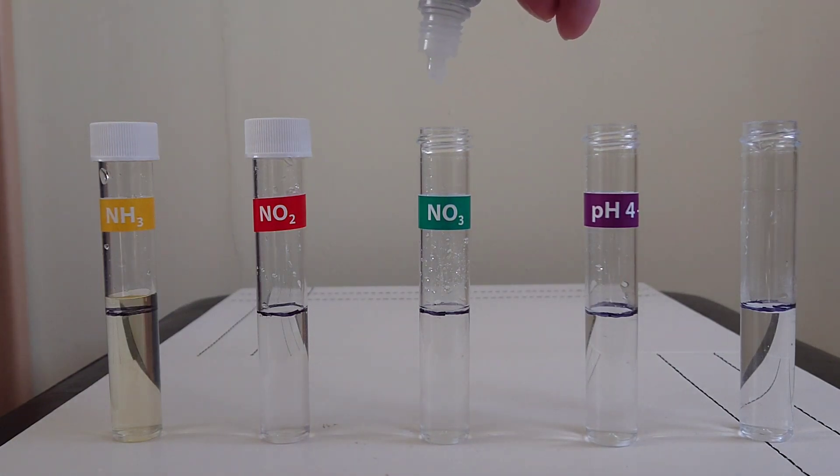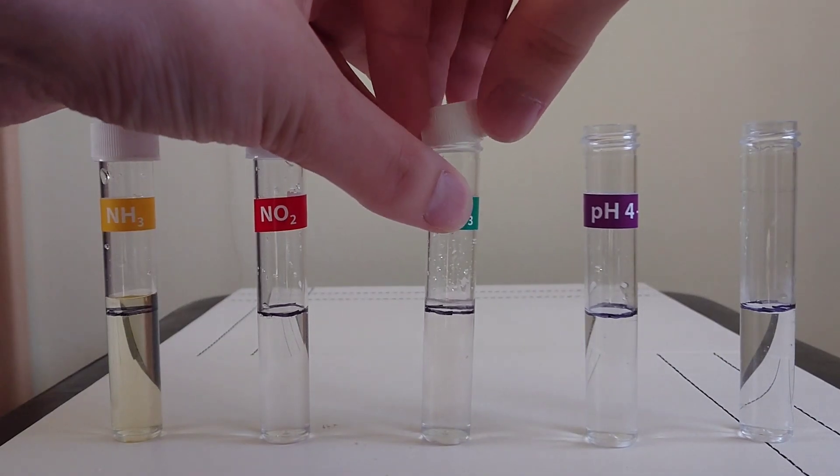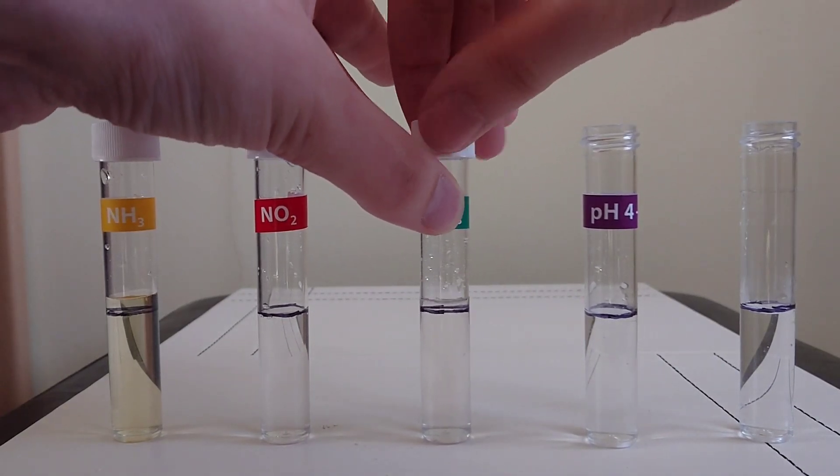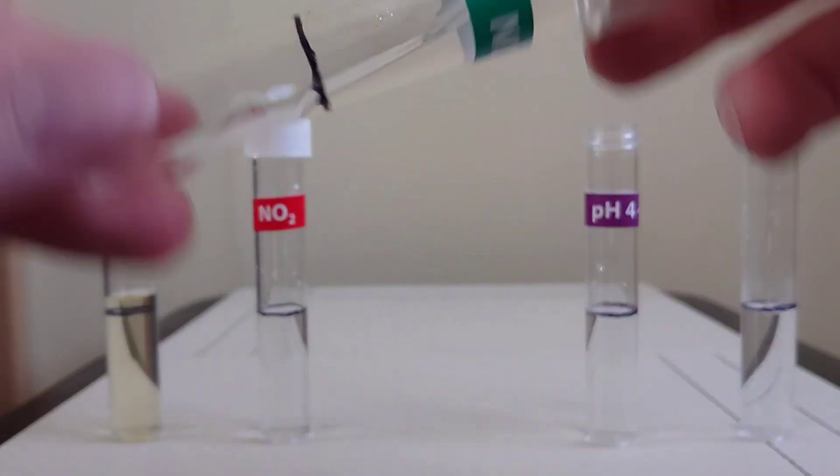So there's test bottle number one, adding six drops, and six from bottle two. Cap the tube, give it a mix.